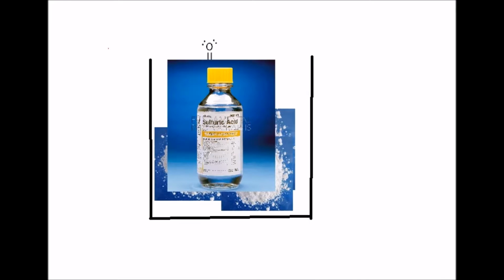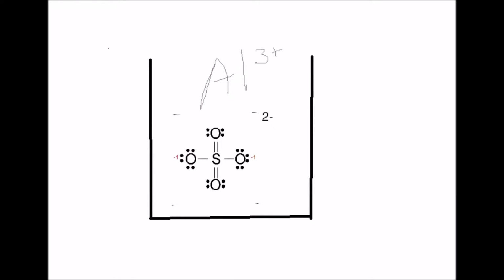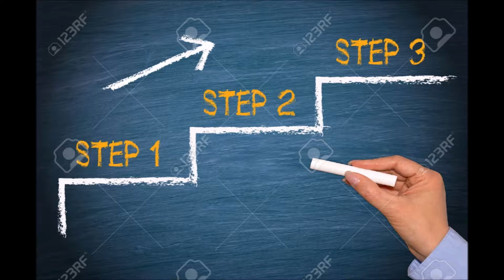After that, we added more sulfuric acid, which neutralized the aluminum hydroxide, causing it to form aluminum ions and forcing the aluminum hydroxide to dissolve within the solution. While in the original procedure, the adding of the sulfuric acid was split into 2 different steps, in our own personal procedure, we morphed it into one big step, where all the sulfuric acid was added to the solution and then incorporated using a stir bar and heat to speed up the reaction.